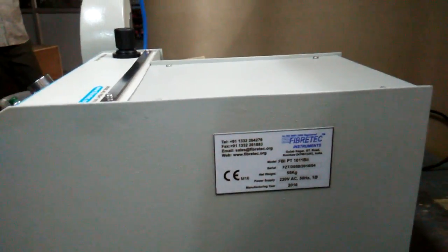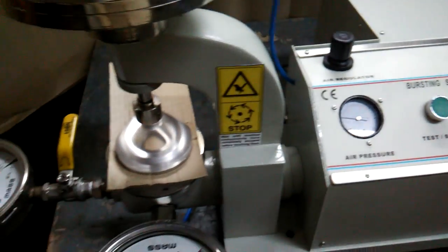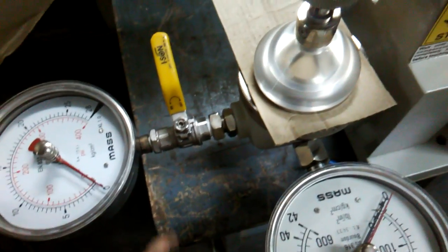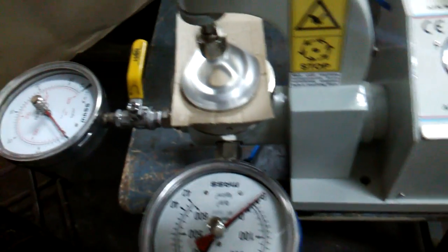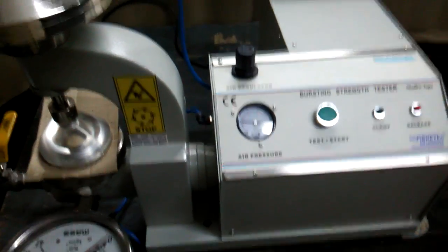We have this certified. Here we have the power connections — you have a power switch on/off. This particular model has pneumatic clamping and we have two pressure gauges: 600 psi as well as 400 psi. The lower 400 psi pressure gauge is controlled by the control valve.